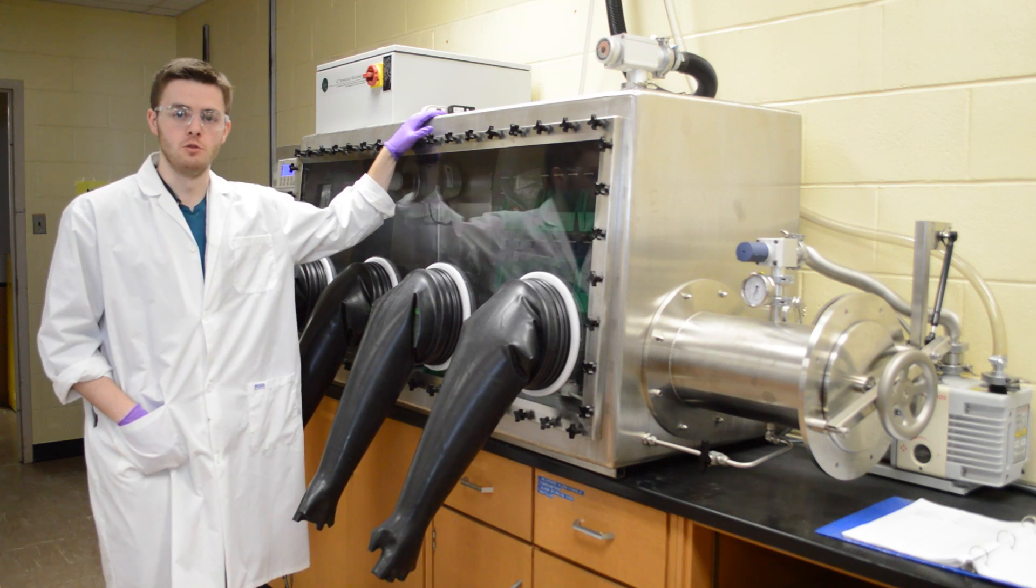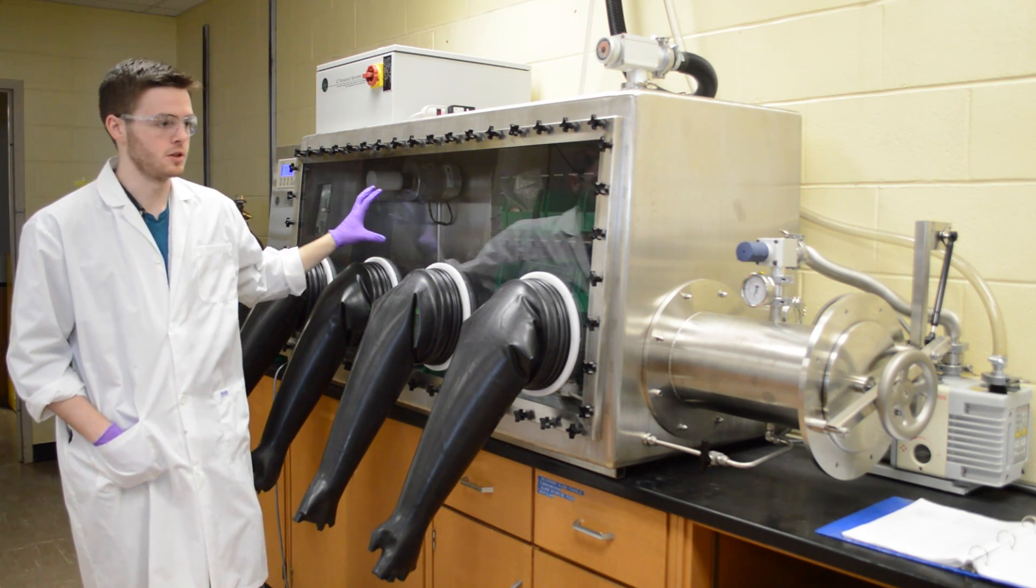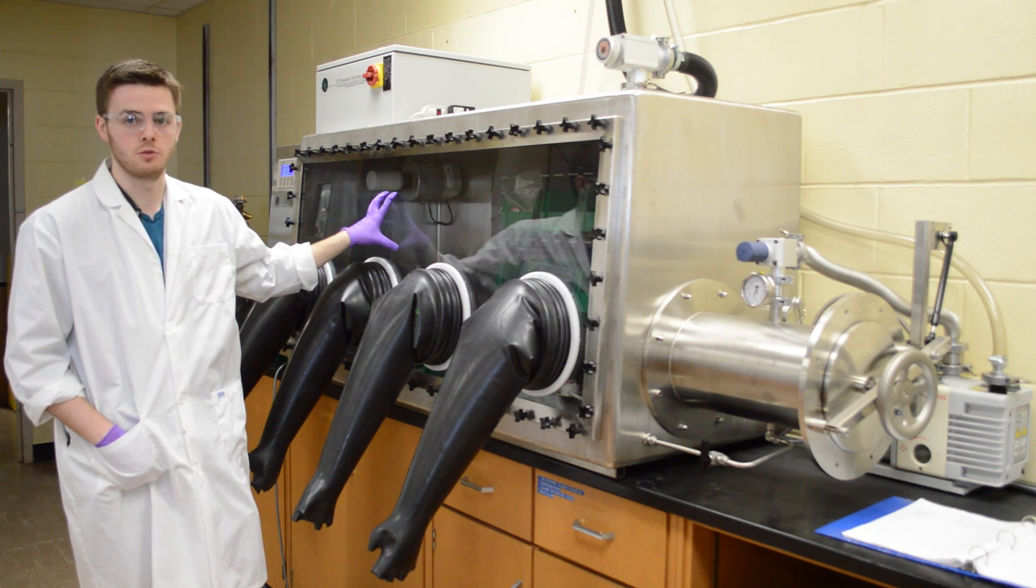So this is the glove box. What these are used for is to do chemistry generally with air-sensitive materials, because everything inside of this is under nitrogen atmosphere at all times.